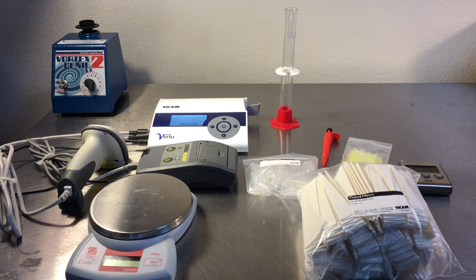Disposable items include sample test vials, extraction tubes, filters, and pipette tips.